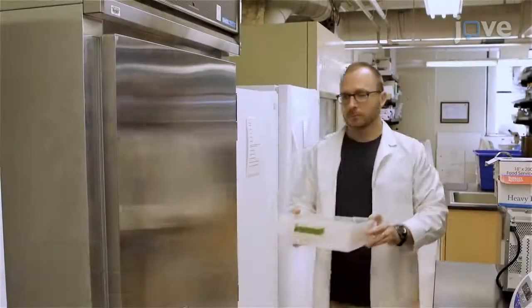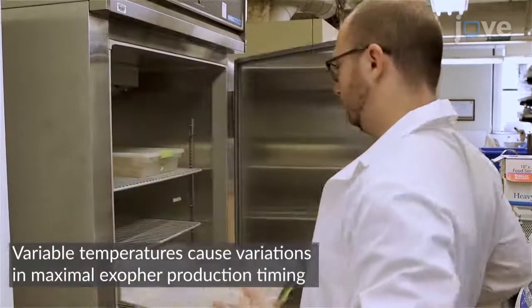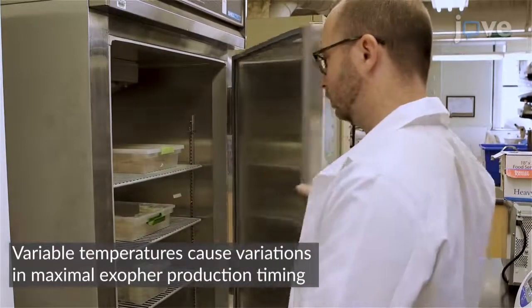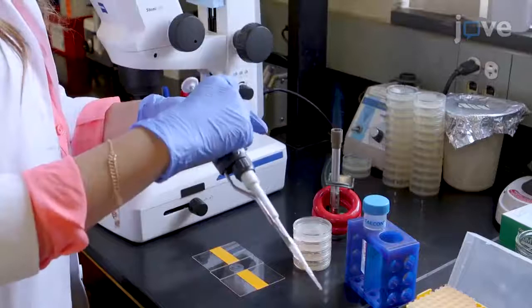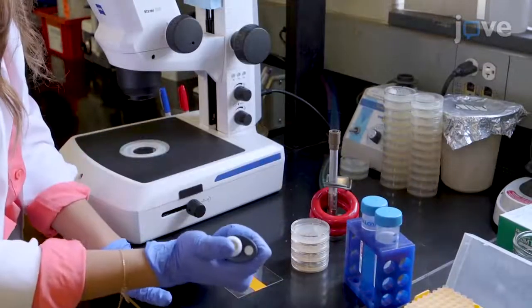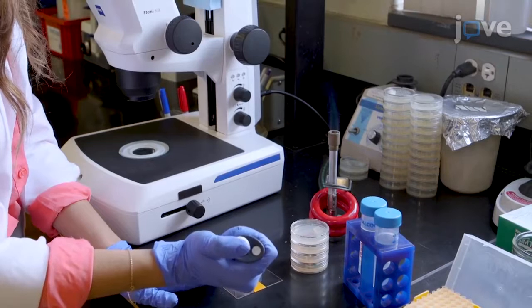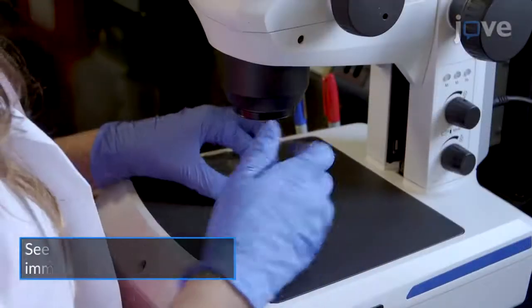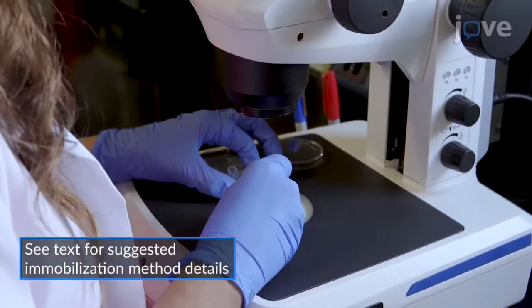For basal conditions, house C. elegans at the same biological age at a constant temperature of 20 degrees Celsius. For live imaging of the intracellular dynamics and characteristics of exopher, place up to 20 animals onto an agarose pad on a glass microscope slide, and immobilize the animals.